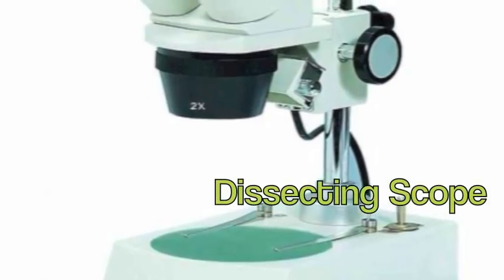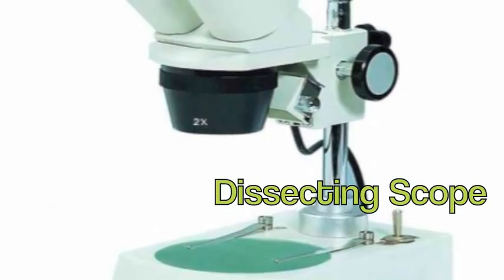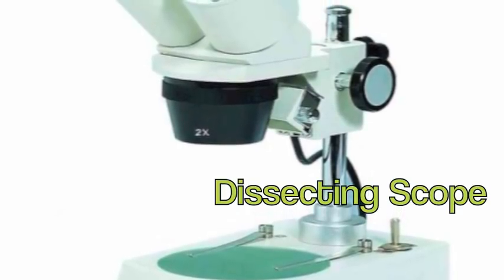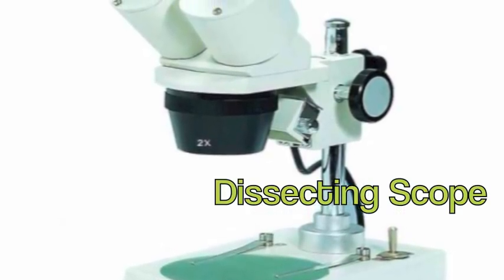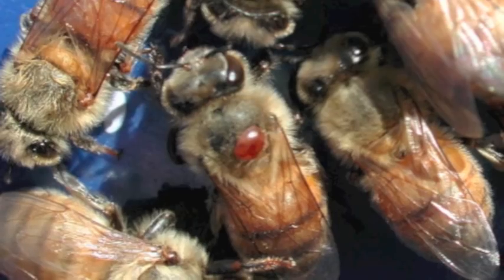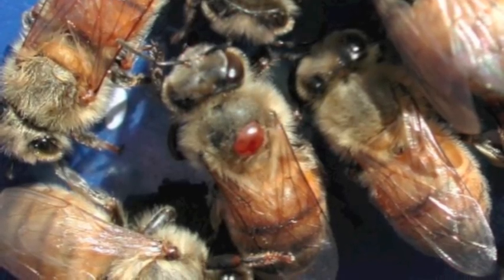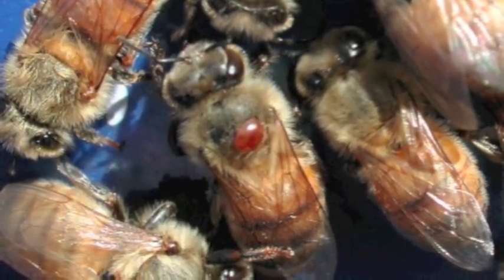A dissecting scope will give us a 3D image of an object when illuminated with light. Here you can see this red mite on top of those bees.